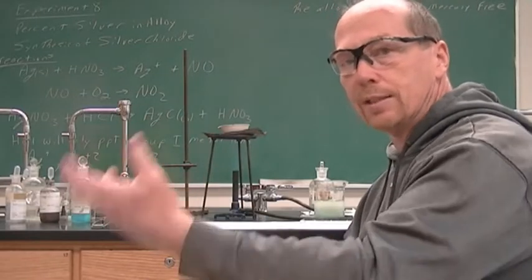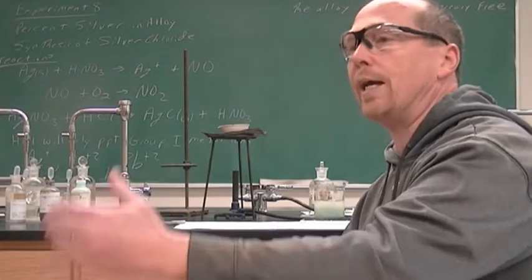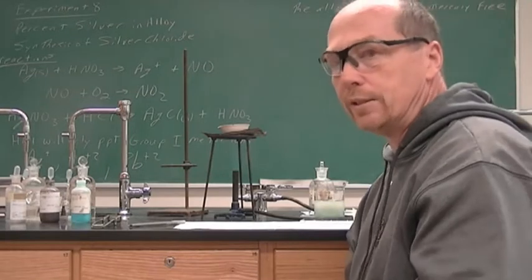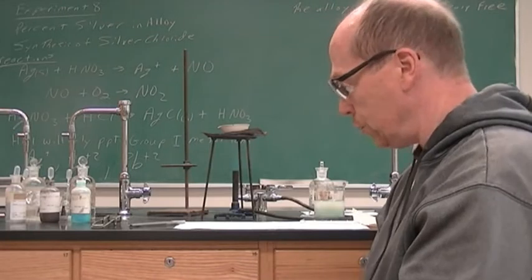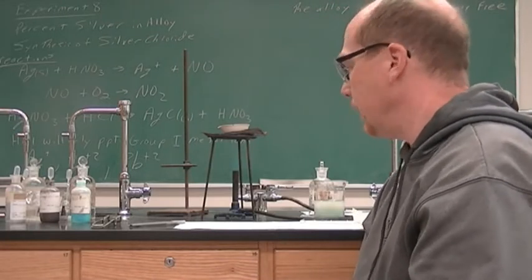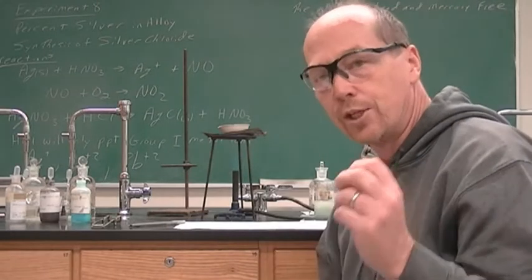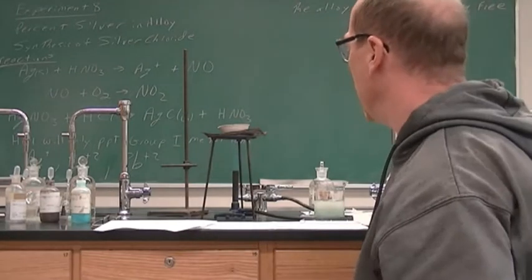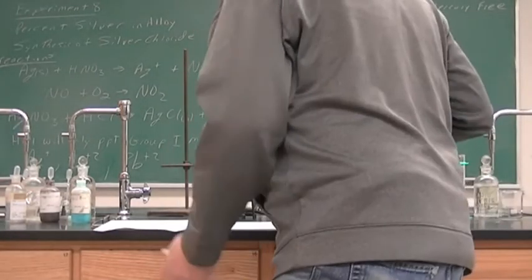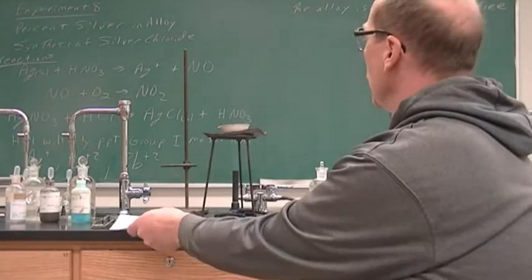You have the periodic table. You have your chloride ion. All right, so you know the molar mass of that. Molar mass of that divided by the molar mass of the silver chloride. Again, silver chloride contains only silver and only chloride. And so those two percentages must add up to 100%. So when it says what is the experimental value, that's what we're finding here. When it says what is the theoretical value, you find that from the masses on the periodic table. Let's see how we're doing. All right, we are boiling water still, so it's going to be a while to boil all the water out.